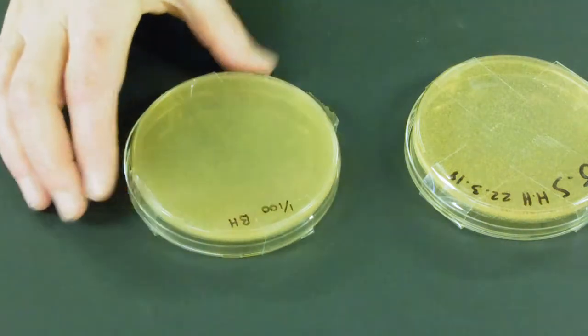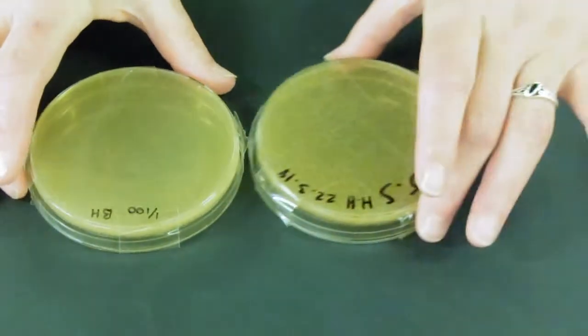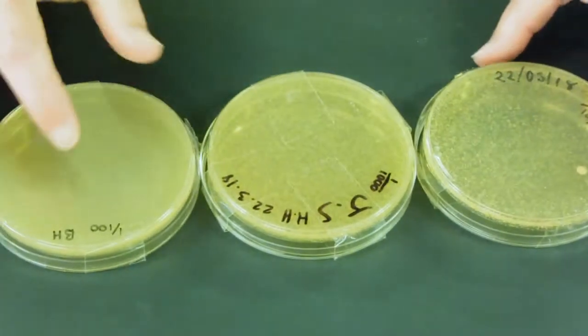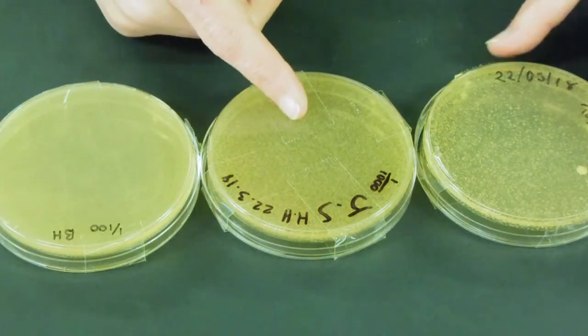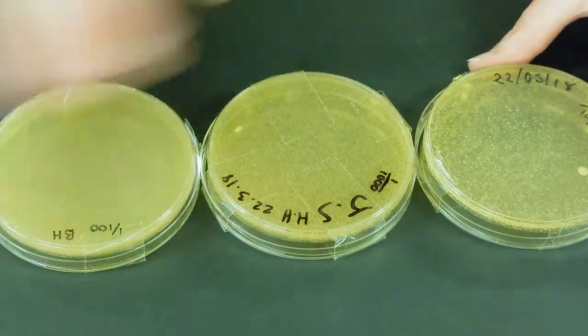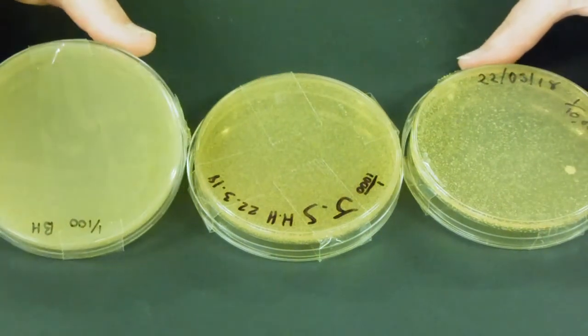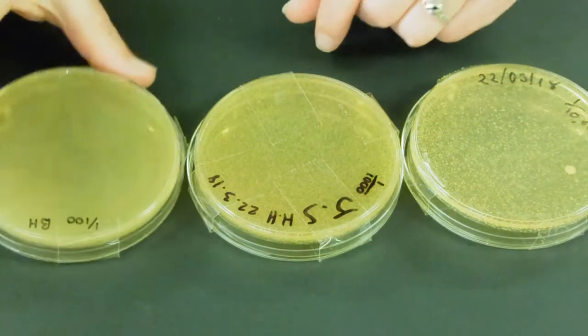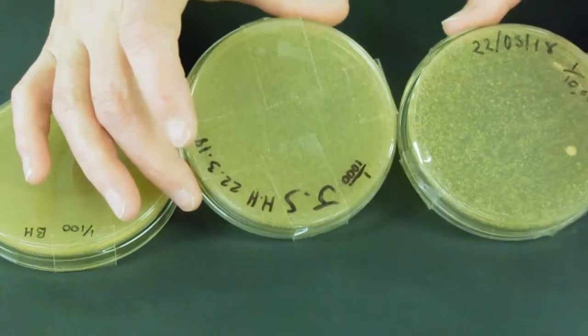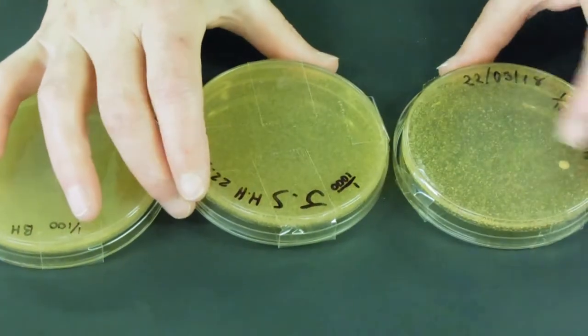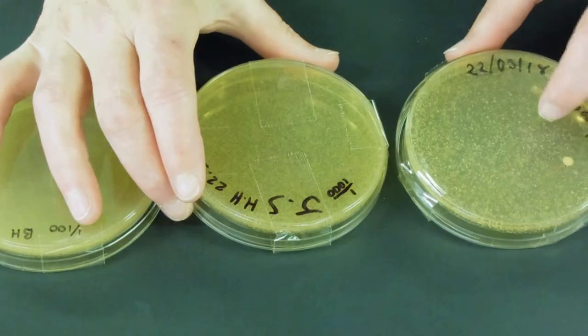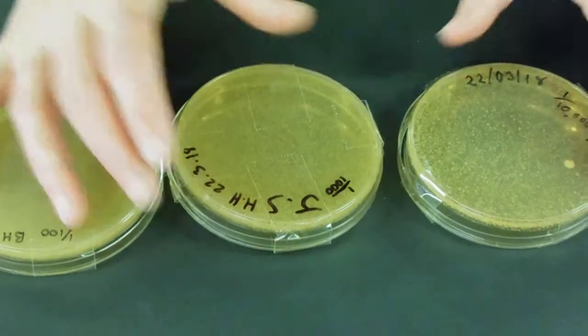We'll move on to the next plate, our next three plates. Here we've got one in a hundred, one in a thousand, and one in ten thousand. And you can see that the bacteria are now, there are slight gaps appearing between them. And they're certainly starting to look, by the time we get to one in ten thousand, like we can see some colonies.